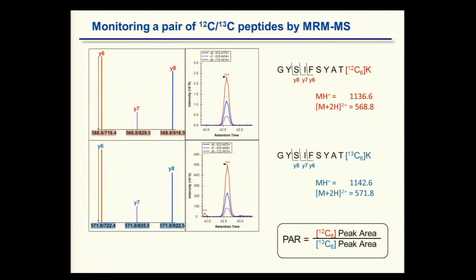And this is a very important phenomenon because this is what actually helps us in detecting and avoiding interferences. The transition ratio among the 3 transitions that we're monitoring is extremely important. And that's what we use as a standard to look for interferences.